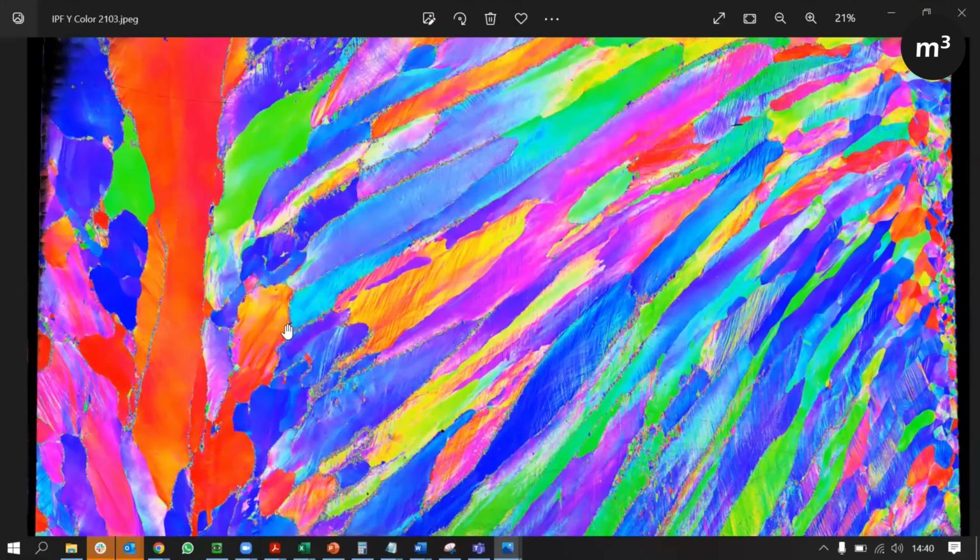advantage of the large area mapping, because this map has got lots of tiny recrystallized grains along the grain boundaries. This map is enormous, but with the new detectors, it didn't take that long to collect. It collected in about 24 hours.